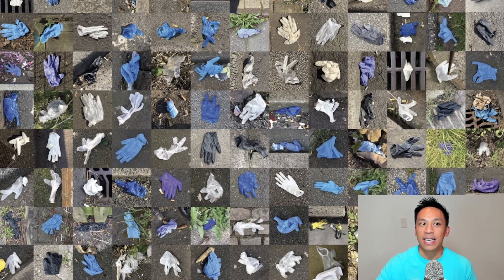We get asked, how do these biodegradable disposable gloves perform? Well, they actually go through the same testing that regular disposable gloves do.